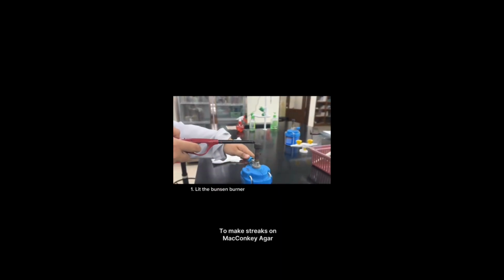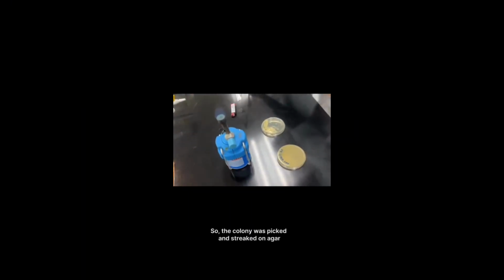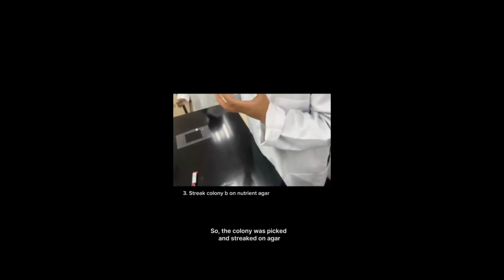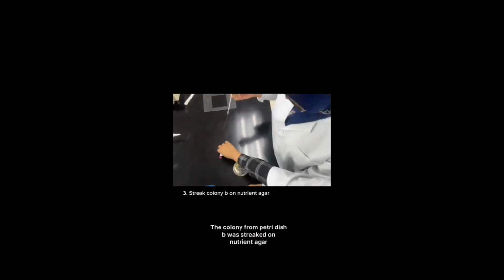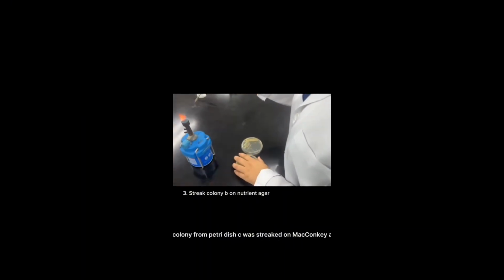To make streaks on MacConkey agar, first light the Bunsen burner. The colony used was the same colony from the oxidase test, so the colony was picked and streaked on agar. Colony from petri dish B was streaked on nutrient agar, while colony from petri dish C was streaked on MacConkey agar.